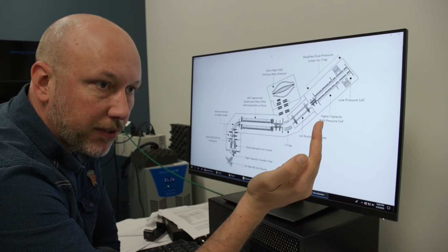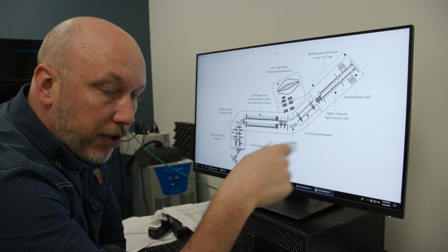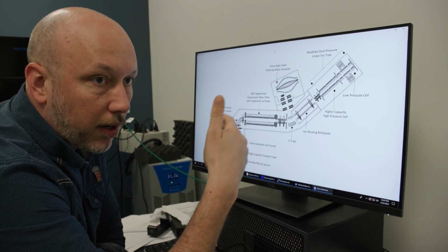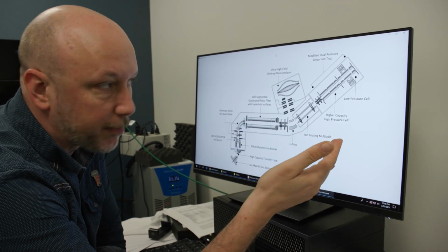And it's really important for us to understand which exact amino acid is modified, so that we can go and do functional studies where we can mutate that residue or monitor it in a healthy control or a disease state, right? We need to know exactly where to look for this modification.